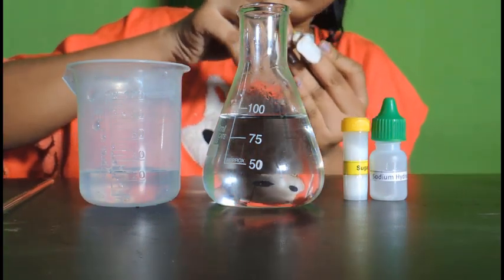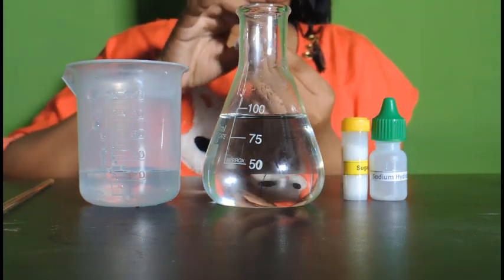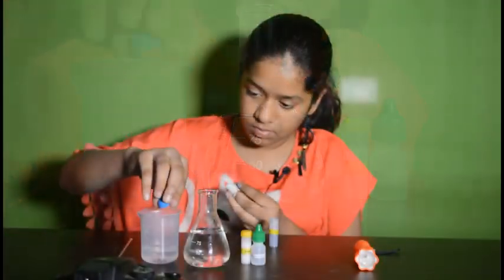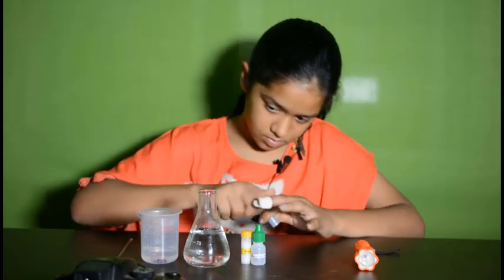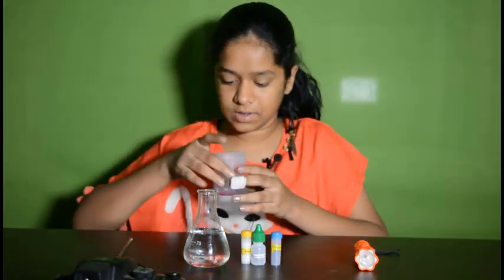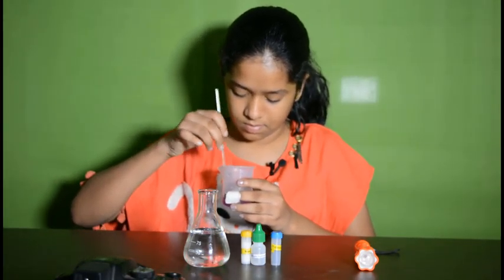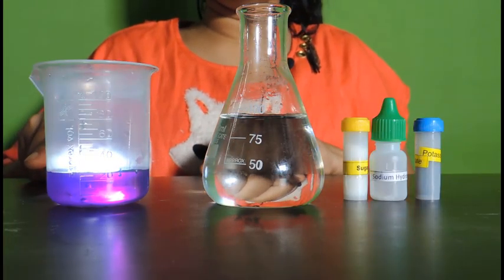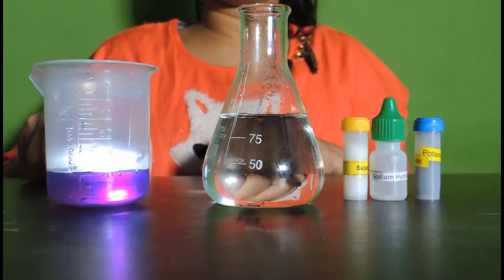Let's begin with adding potassium permanganate into 20 ml of water. Add less amount of potassium permanganate, so I am adding 2-3 crystals. Now let's stir it well. Now the solution is in violet color because of the presence of permanganate ions with oxidation state plus 7.